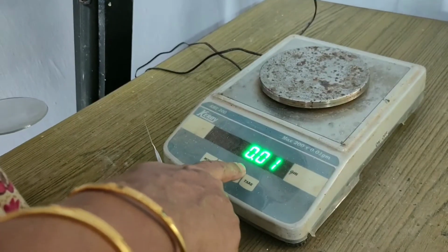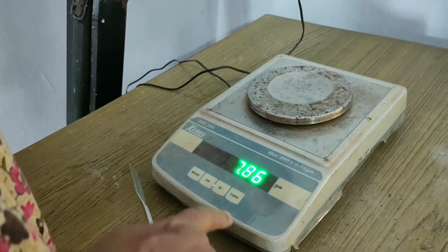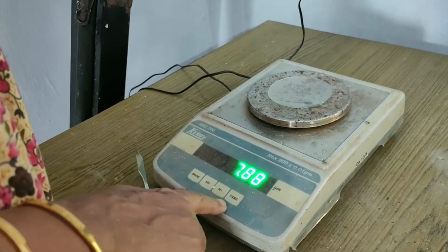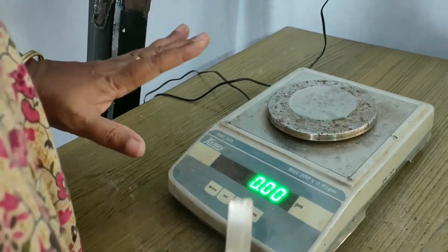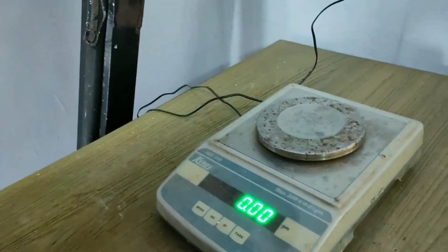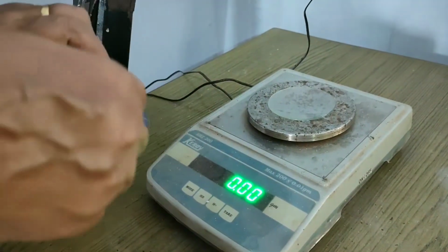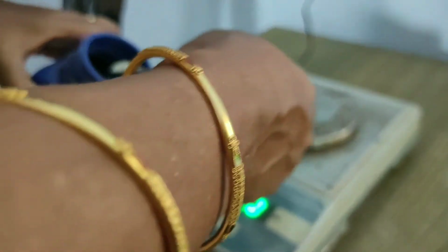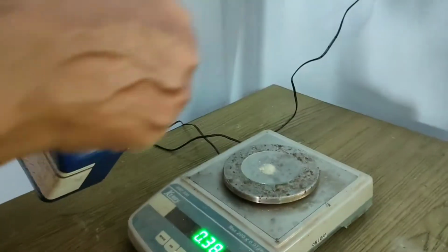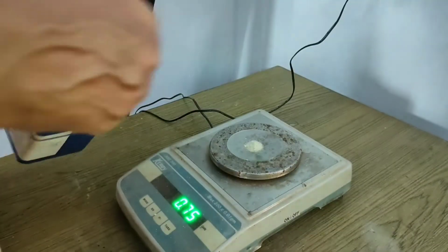Zero here. What you have to do, you keep the watch glass over this pan. Then the tare button is here. You touch that, then it will again become 0. Then you start adding, you will have to take 1.96 gram. So you add the substance till it is 1.96. Exactly 1.96 you can take.